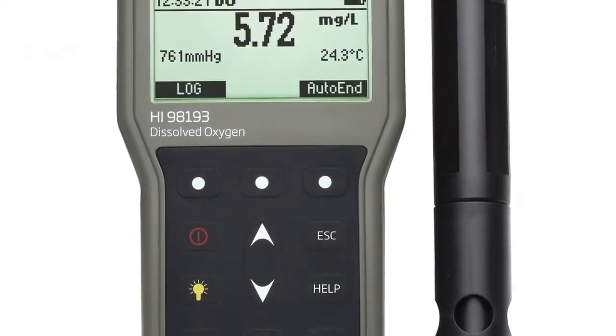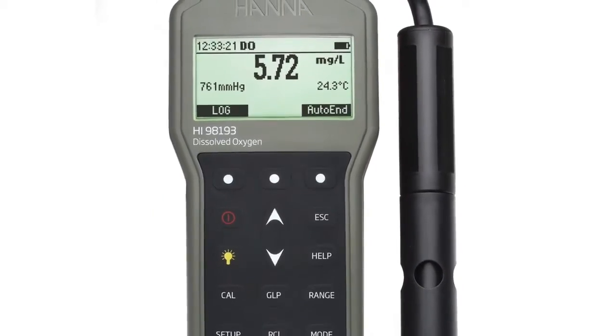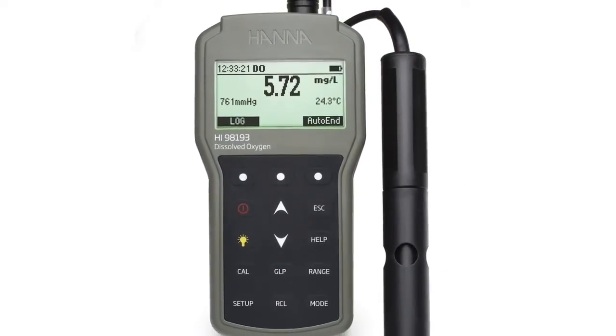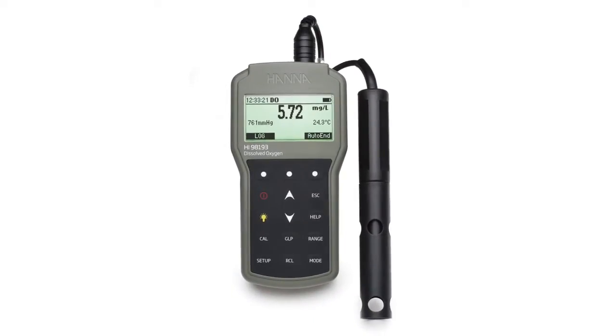The HI-98193 is part of Hanna Instruments' line of portable meters and is used in the measurement of dissolved oxygen, biochemical oxygen demand, oxygen uptake rate, and specific oxygen uptake rate.